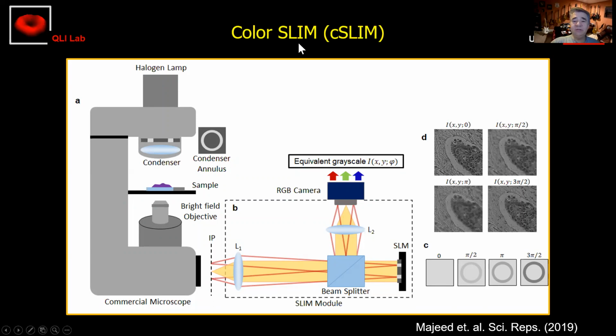Anyway, one of the criticisms was that asking for a pathology slice that is not stained, in other words, skipping a step in the pathology preparation, disrupts their process, slows them down. So the question was, can you do it on the already stained slices? So the answer is, of course, we can stick a stained slide in and see what comes out. But the problem is how the staining actually affects our phase information. So basically, this is what we figured out in this paper here.